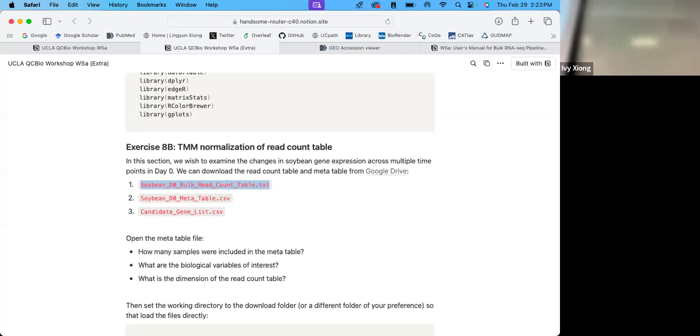I think it's the laptop configuration. Sometimes when we're trying to install things in R that need C++, you need the GCC package active. Xcode usually takes care of that. It's more for program developers. When I had that installed, it took care of the GCC in the background. Okay. Yeah, just try that.